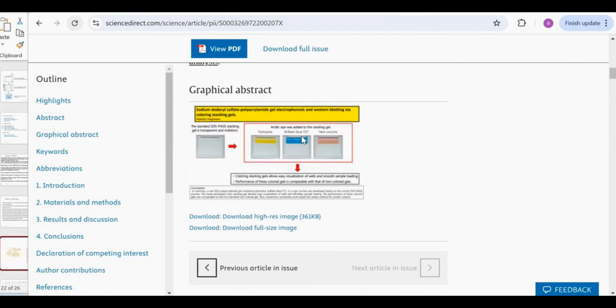Another technique is two-dimensional electrophoresis, which has a lot of applications in proteomics. Maybe initially you are doing blue native gel, that is another technique in electrophoresis. Blue gel electrophoresis, that is also something we have to talk about as an advancement. It is not there in the syllabus, but at least you should be aware of the terminologies. So blue gel is followed by SDS-PAGE. One gel, one dimension, then the second dimension. These are the concepts that we have to talk about.